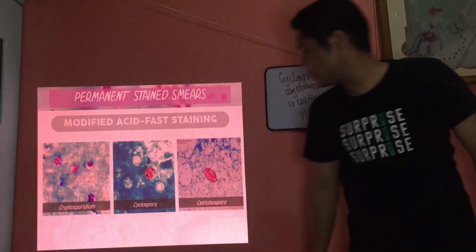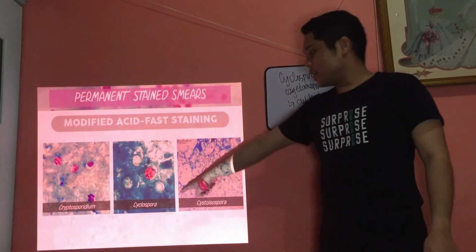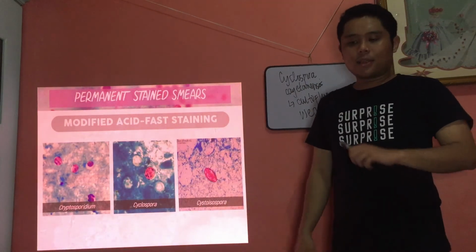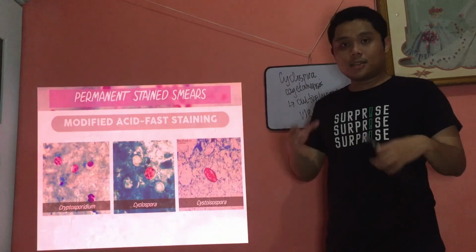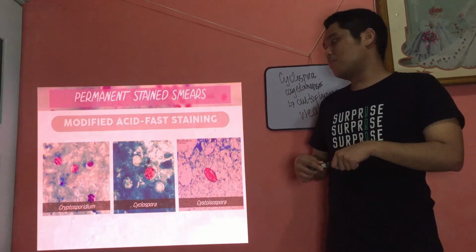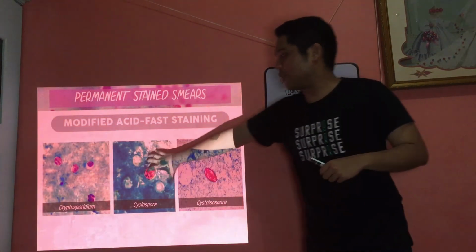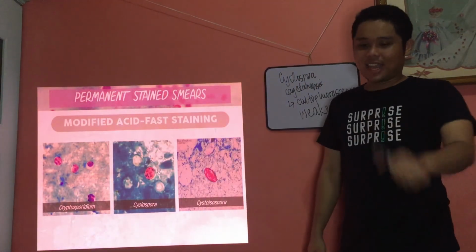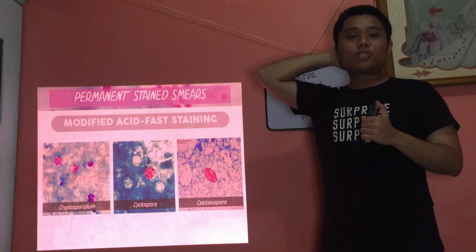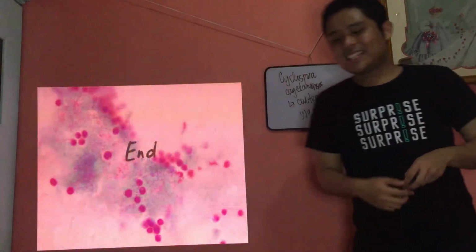Ayan, so as you can see, these are your Cryptosporidium. They are spherical, the oocysts. You have Cyclospora and you have Isospora. Diba? Cystoisospora belli. The ones that I let you see under our virtual microscope activity. Diba? So if you remember. So they appear color red, pink to red, and a blue background. Okay? Alright. Ayan. So those are your parasitic oocysts. Again, that's what we use our modified acid fast for. Okay. Alright. And that's the end.